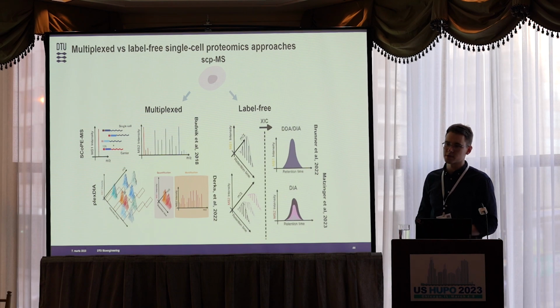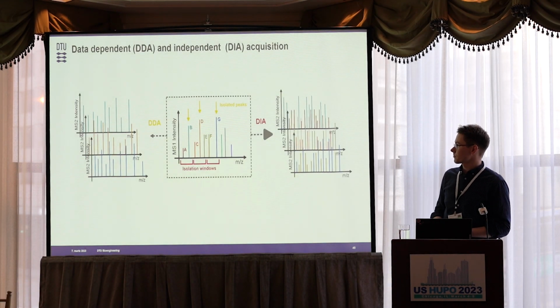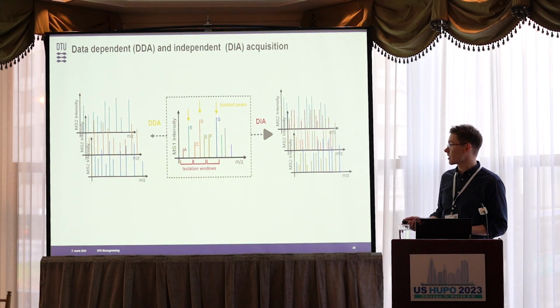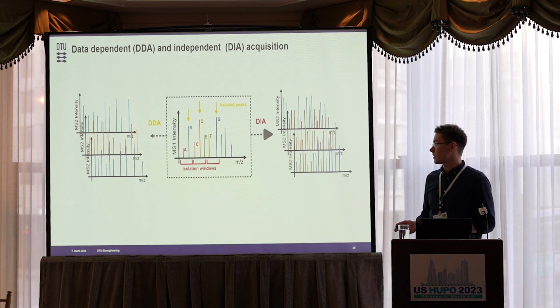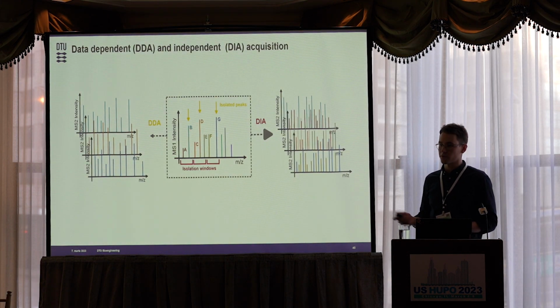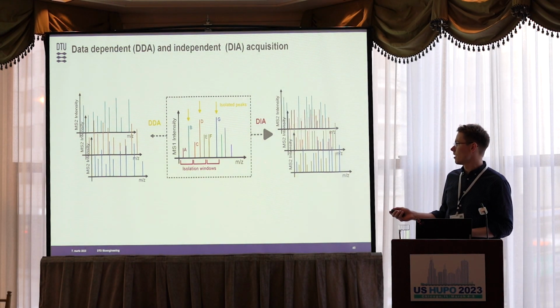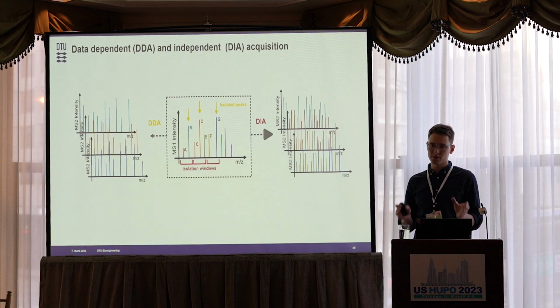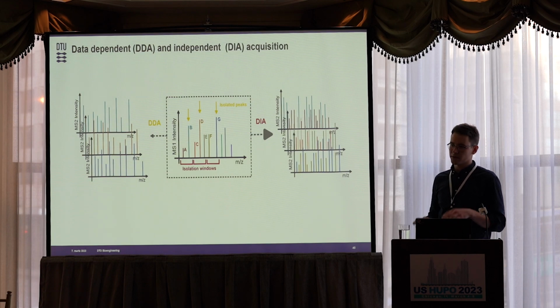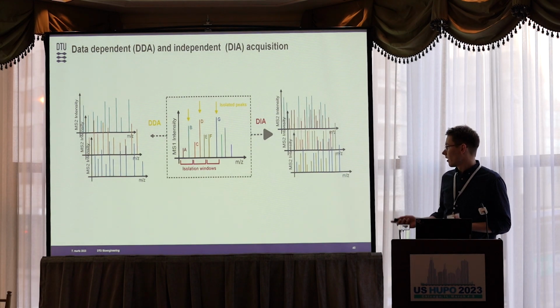There are a few references that so far have reached the biggest proteome depth with these methods. Just a refresher for those who missed the LFQ Battle Royale on the first day: you can do label-free with either DDA or DIA. In DDA you just select the most intense precursors for further fragmentation and you generate rather clean spectra, although they are chimeric to some extent. While in DIA you sequentially isolate all different segments of m/z and in theory acquire the spectra of all the precursors present in the sample.